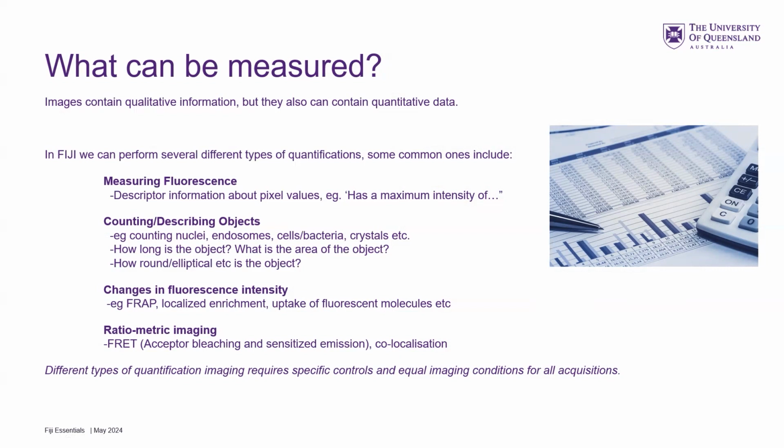If you want to say my thing goes to the membrane at this rate, you use the microscope to bleach away part of it and watch the intensity come back, we can quantify that change over time. If your cells are eating or drinking stuff, or you're injecting stuff into a tail vein and looking at it diffuse through tissue, you can measure that across time. And you can do ratio work, where you do FRET and other kinds of calculations. So there's lots of stuff you can measure, because really an image in ImageJ is just like an Excel spreadsheet with numbers for each pixel.